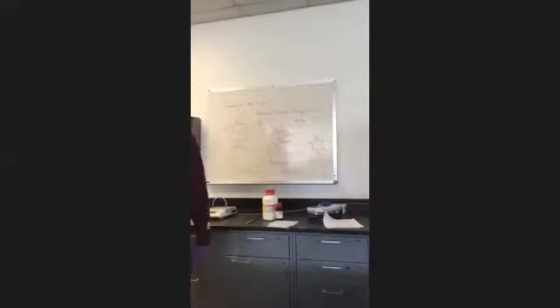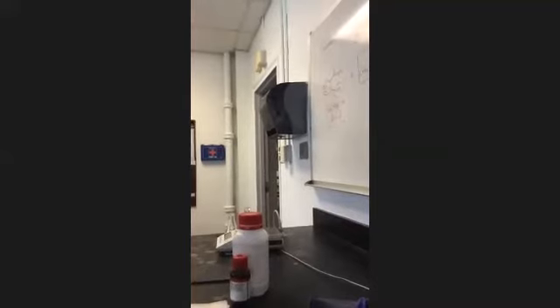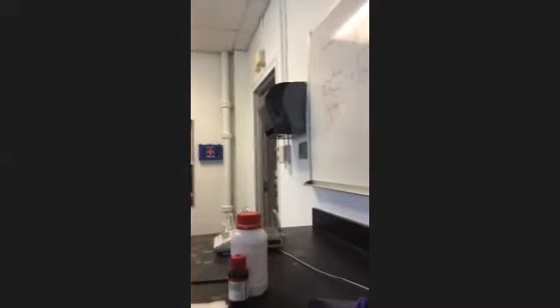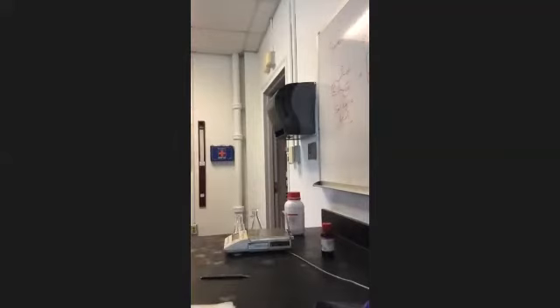All right. So I want to have each group come up and weigh their stuff, but for you to demonstrate it, I'll go first. So I'm gonna move the camera over here for the Zoomers. And then let me blow this up. Okay, never mind. All right, you should be able to see the balance from here. So I'm gonna weigh your stuff out for you. So this is the way we're gonna set this up. Let me show you that.